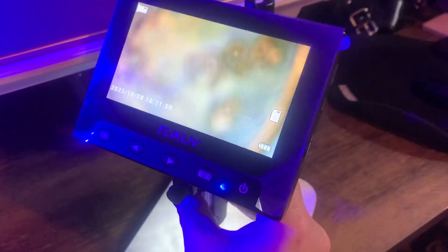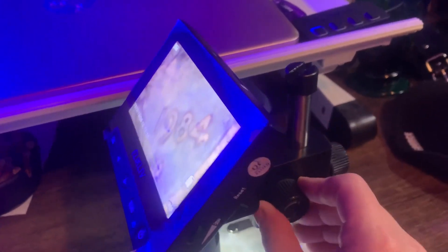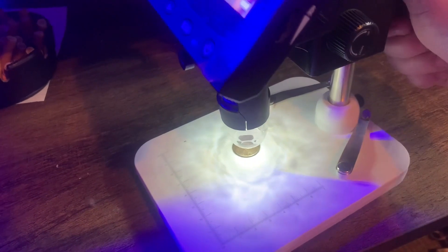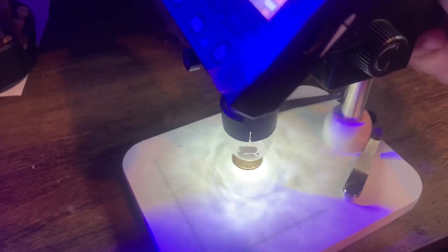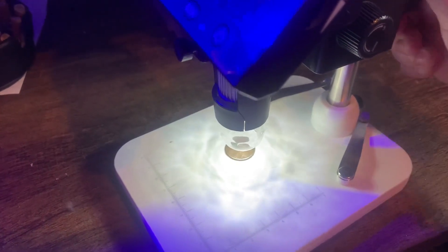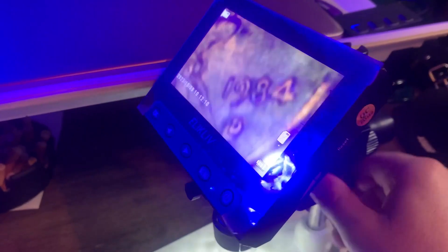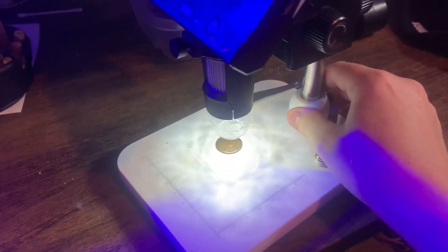It also has this little knob in the back here. You just unscrew this a little bit and then it'll lift up and down. That one lifts this up and down, but this one back here will lift up and down as well.